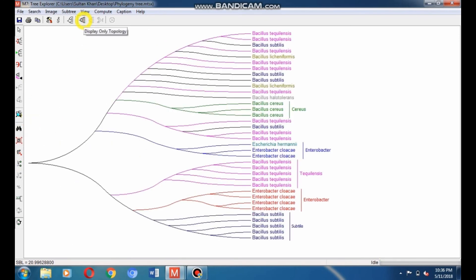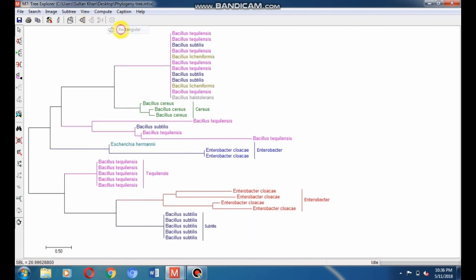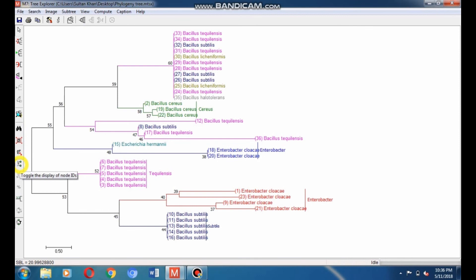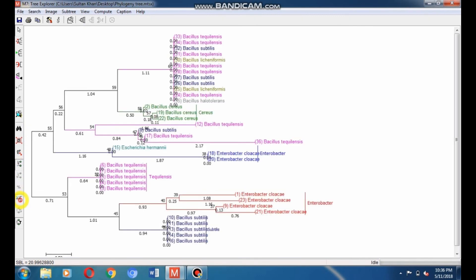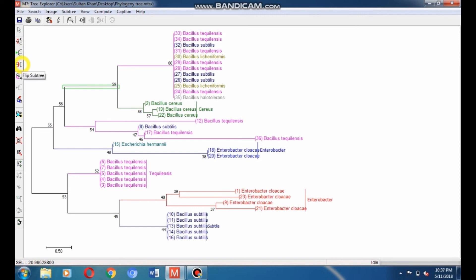Go to Toggle Display of Nodes and select it. You can display the branch length by going to the Display Branch Length option and allowing it to display. Here you can see the branch length. You can also hide or display the taxa names of the phylogeny tree by single click. You can swap or flip the subtree — put the cursor on the node of any clade and click Swap Subtree. You can also flip it or place a root by putting the cursor on any clade node and clicking Place a Root.